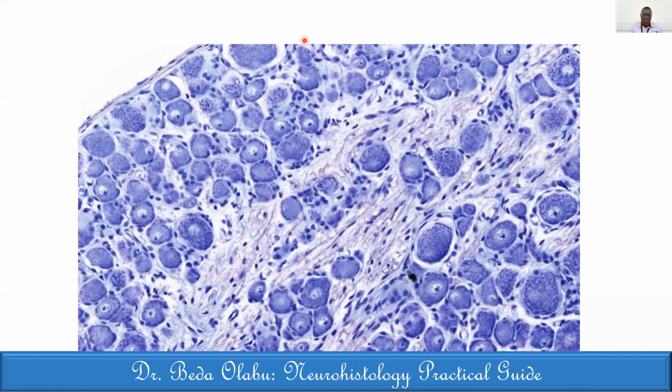Okay, with those descriptions I've given you, what could this structure be? Remember, it is encapsulated. Cell bodies grouped together, interspersed with fibers. Okay, any attempt? Anyone? I'm looking for a hand up.